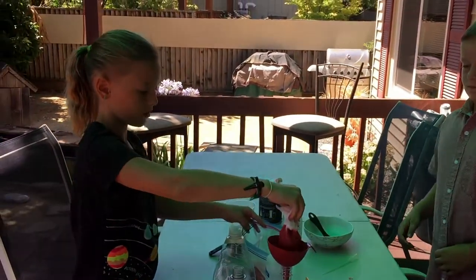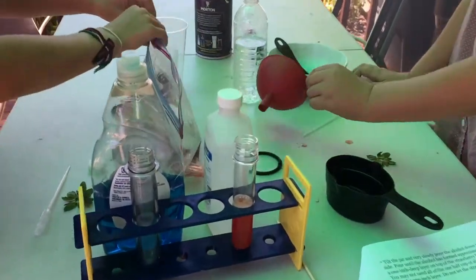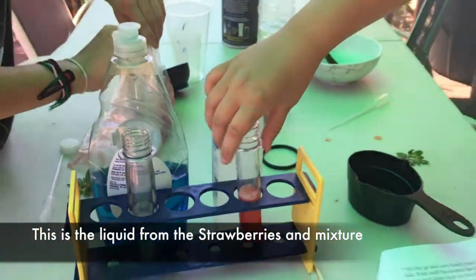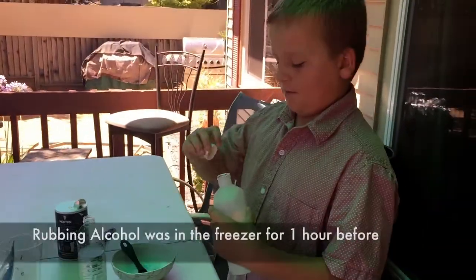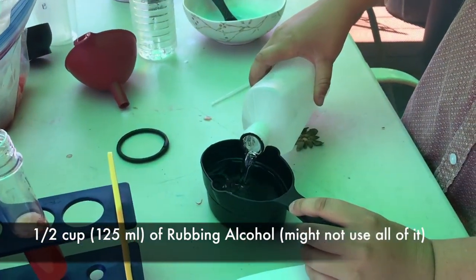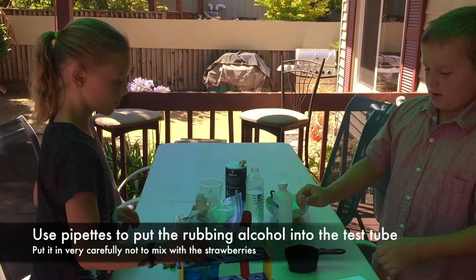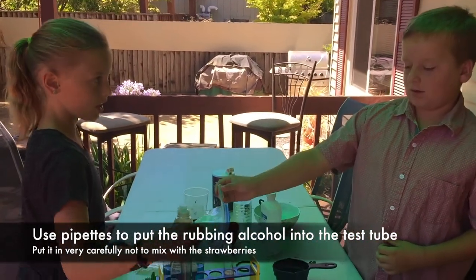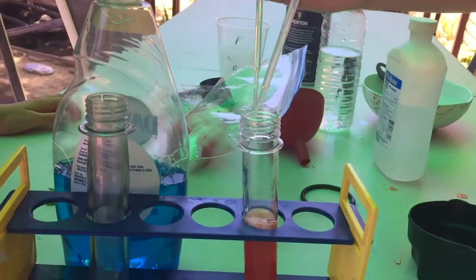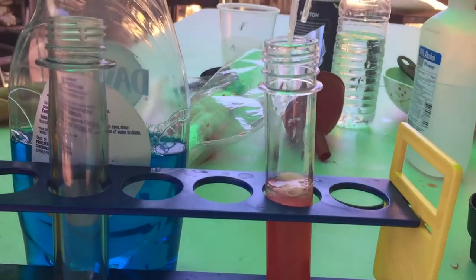Now we are going to pour this into the test tube and take the funnel out so we can see how much juice got in there. It's all strained out. Now we're going to get some rubbing alcohol, fill about half a cup, and using pipettes, slowly put it in on the sides of the strawberry juice so it rests on top.